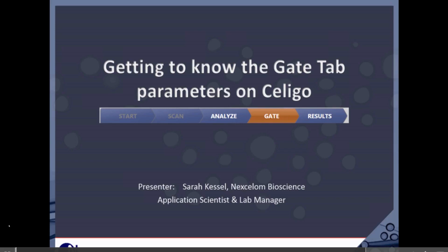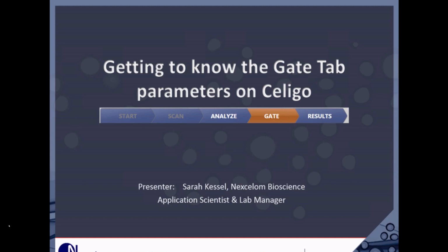A little heads up, the first portion of the presentation today is going to be a PPT with some technical information, so it's a good time to take notes on that part of it. And the second half will be showing you examples on the Celigo of different applications you can use with the gating tab. So the first part's going to be more verbiage and technical detail stuff, so that's a note-taking portion.